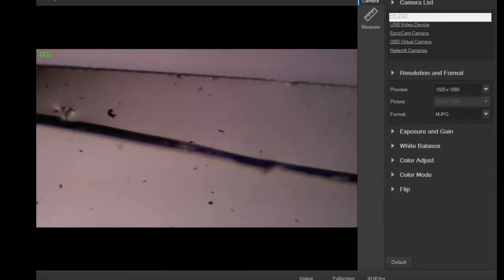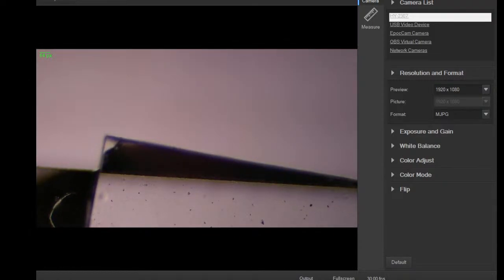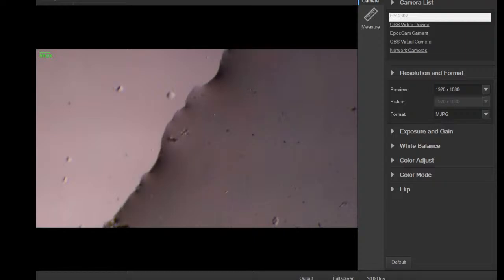So again, I put too much water on this time, so it's going beyond the cover slip. Usually the surface tension bounds it to the cover slip, and then it's much easier to find the critters because they're bound inside the little compartment formed by the cover slip and the slide. See how the cover slip is sticking over a little bit? And then this is the overflow because I put too much water on. But you get this kind of a cool curved effect from the edge lighting. Gives it a 3D quality to the water.